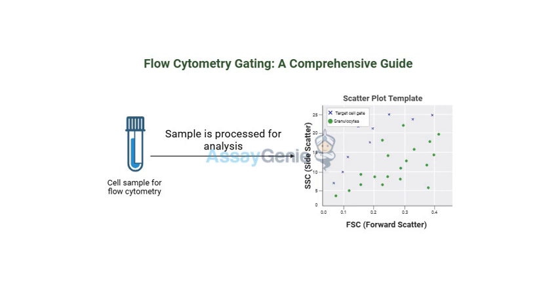This is all so powerful, but it sounds like it takes a lot of planning, right? And a deep understanding of all these markers and stuff. Yeah, definitely. When you design a gating strategy, it's like coming up with a good plan. You've got to think about your research question, the markers, and the biology of what you're studying. So it's like being a detective, but also a strategist. Exactly. So, do you want to go over some practical tips for our listeners? Things they should remember for effective gating. Yeah, definitely. It's always good to review the notes before we head out into the field.